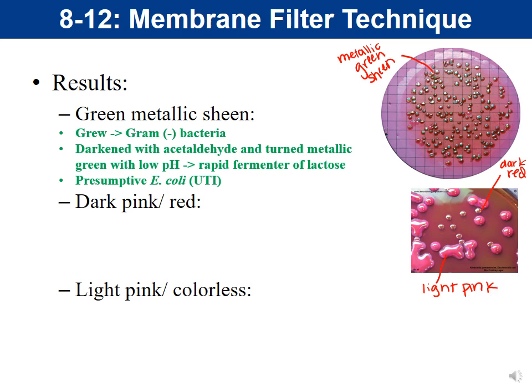So would this bacteria be coliforms? And the answer is yes. This is positive, and it's positive because it's a gram-negative bacteria that ferments lactose to produce acids and gas.